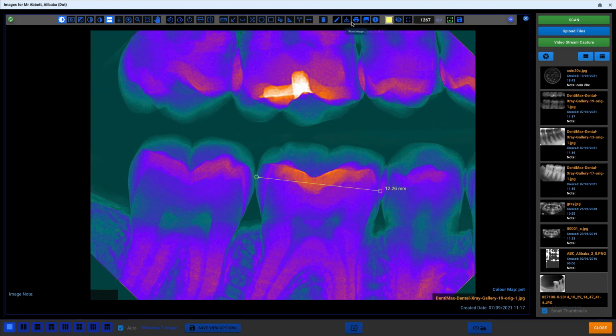The abbreviation ROI, Region of Interest, vaguely stands for annotations in our context. First, download the image with ROI. It will download the image as it is seen on the screen with all the adjustments and annotations.